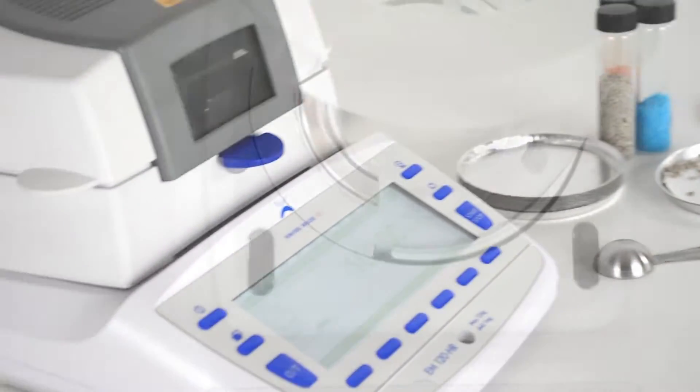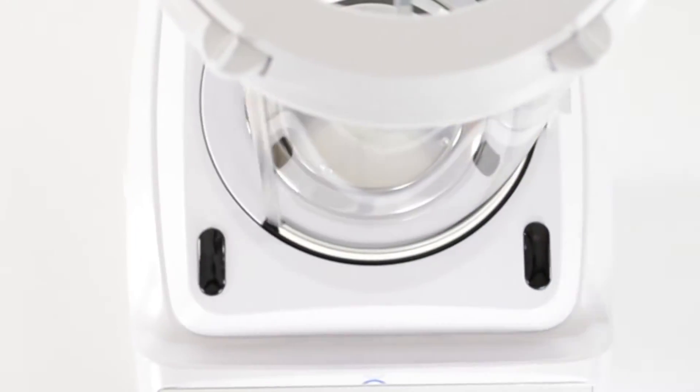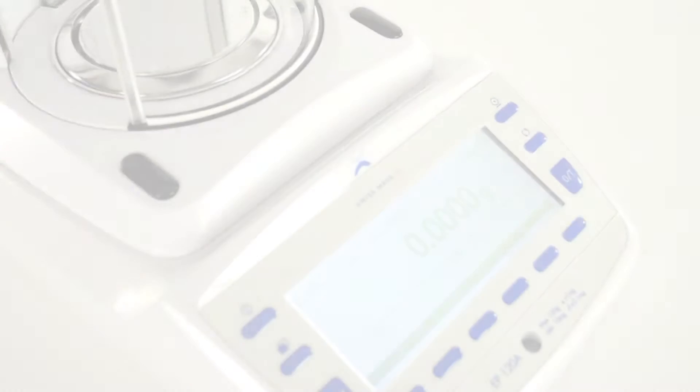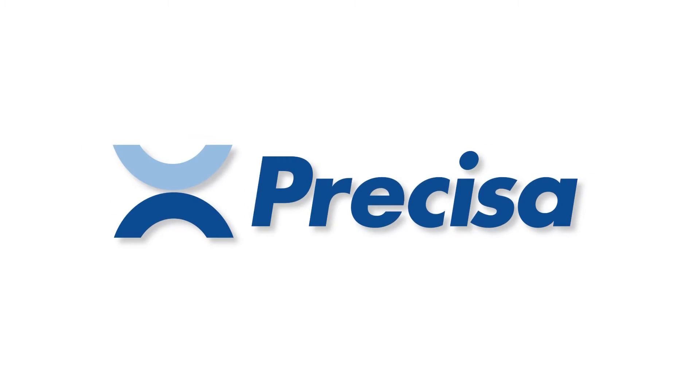Uncompromising. Sophisticated. Elegant. This is Precisa.